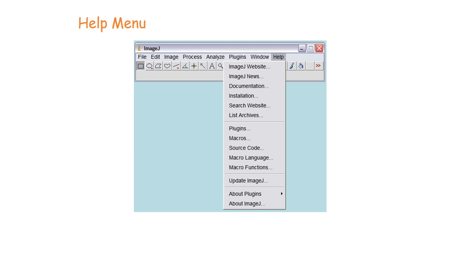To finish, here you have the Help menu. You can go to the ImageJ website, the documentation, and look into different plugins, macros, and many functions. Here you can also update ImageJ. Start playing with ImageJ and if you have any questions, let me know.